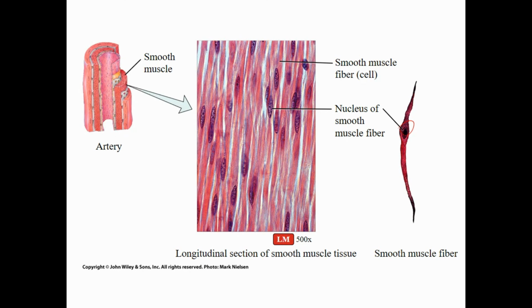So again, if you see this picture, I won't just ask what kind of tissue, I will actually ask what kind of muscle tissue are we looking at. Wow, I don't know why it keeps giving me those lines to shoot out there. So I will help you narrow it down when asking you to ID it.